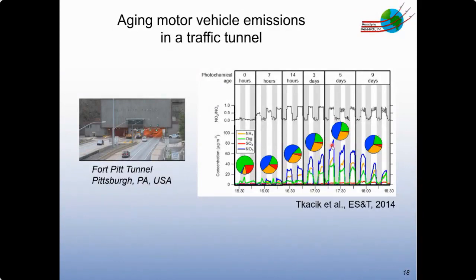So I'm going to show a couple of applications using the OFR to try to get at some of these questions in certain source regions around the world. Here is a time series of aerosol mass concentrations measured with an ACSM in a traffic tunnel in the US. These measurements were made by Tkacik et al. during an afternoon rush hour period in the tunnel. Here, the OFR was situated in the top bore of the tunnel right above the traffic. So we're sampling emissions in real time from the cars going through, and we're aging them in the OFR and getting a semi-real-time indication of the SOA formation potential of the mixed vehicle fleet that's going through.